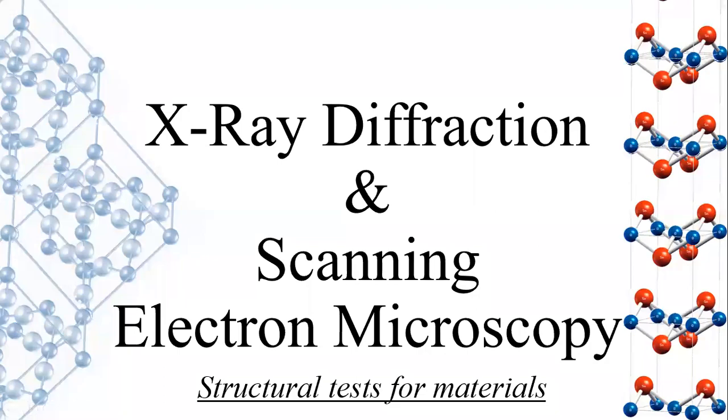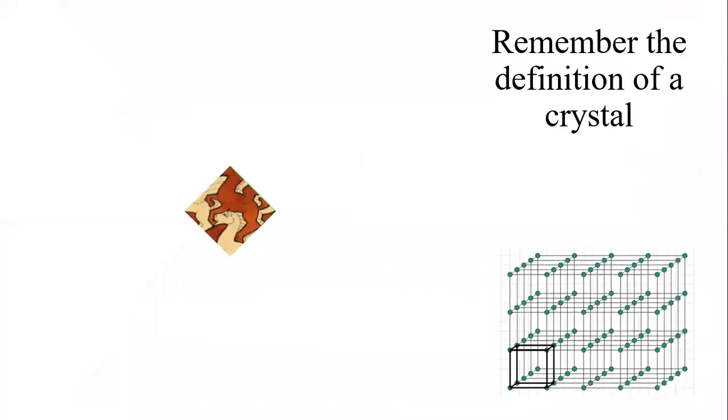Good day, students. Today we're going to talk about X-ray diffraction, and why not? We're also going to talk about scanning electron microscopy, just for you guys. It is important for you to remember the definition of a crystal.